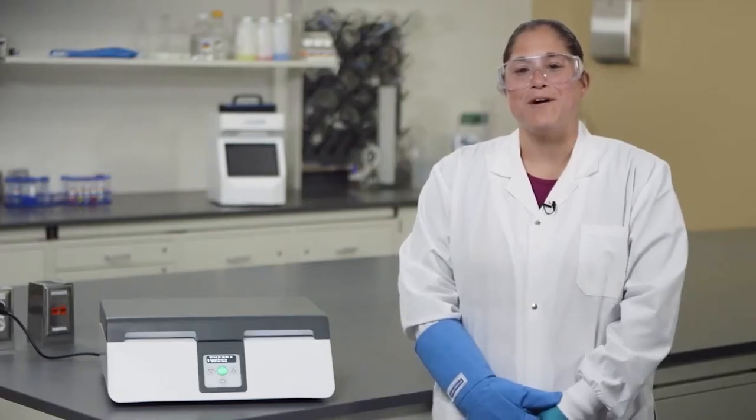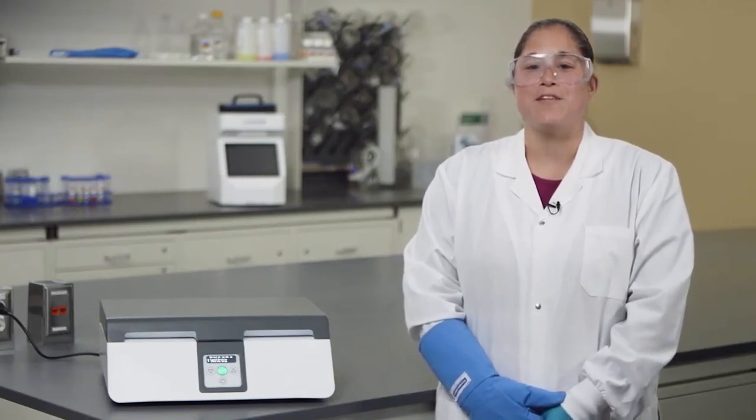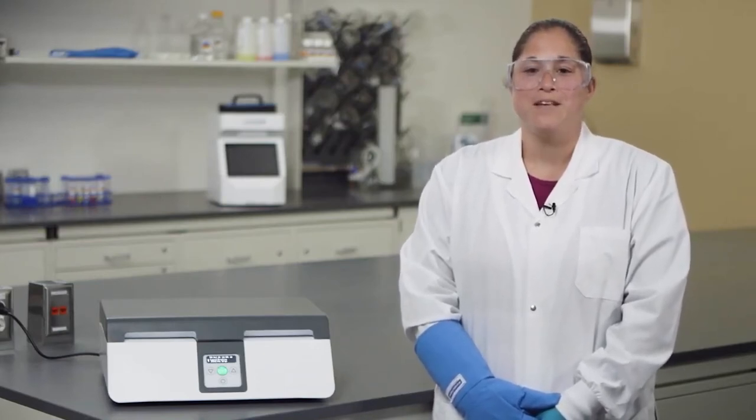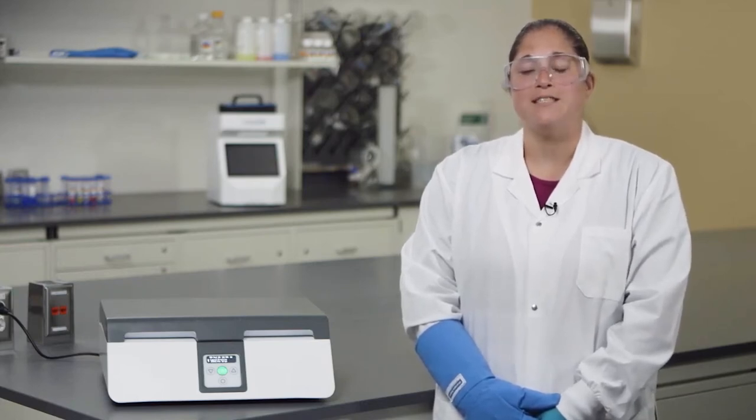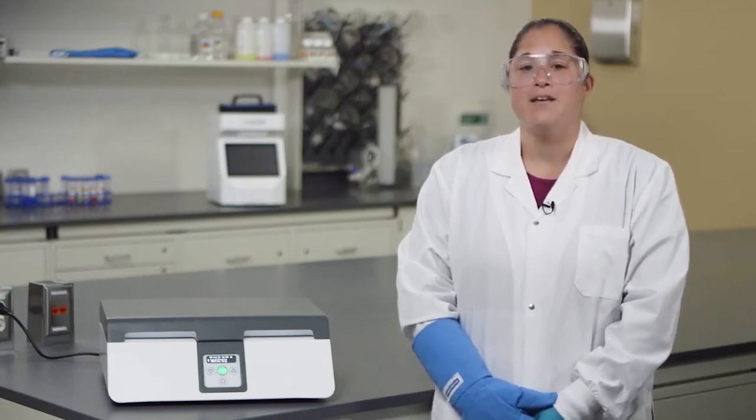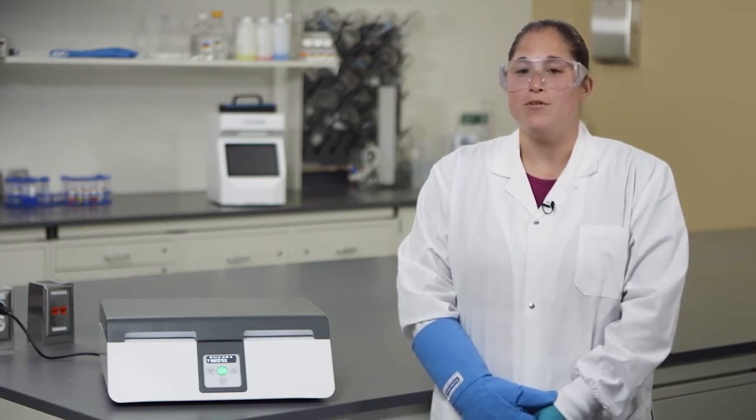The Via Thaw is a controlled water-free thawing instrument that uniformly thaws frozen cellular products. There's a heating tray to place the frozen bag on, which provides constant dynamic contact with the bag to ensure the thawing procedure is both uniform and efficient.